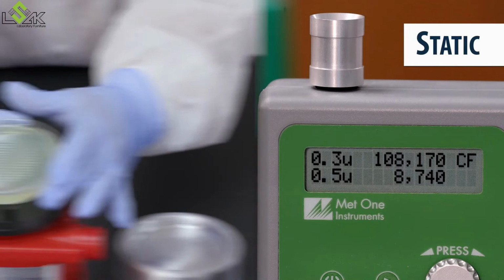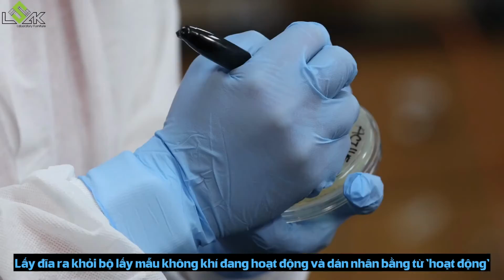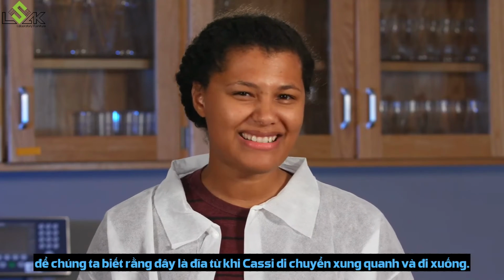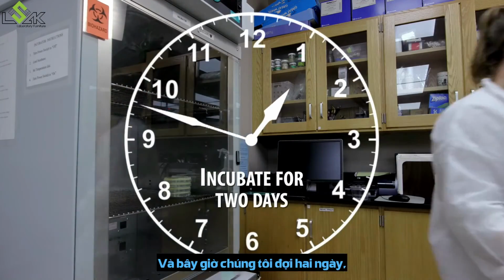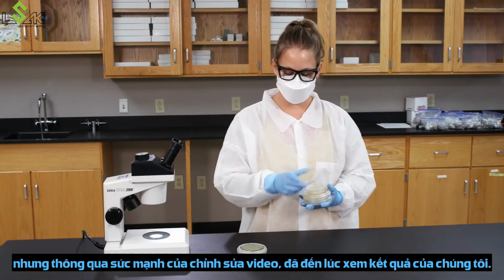100,000. Remove the plate from the active air sampler and label it with the word active, so we'll know that this is the one from when Cassie was moving around and getting down. And it goes in the incubator with the others. And now we wait 2 days. But through the power of video editing, it's time to see our results.